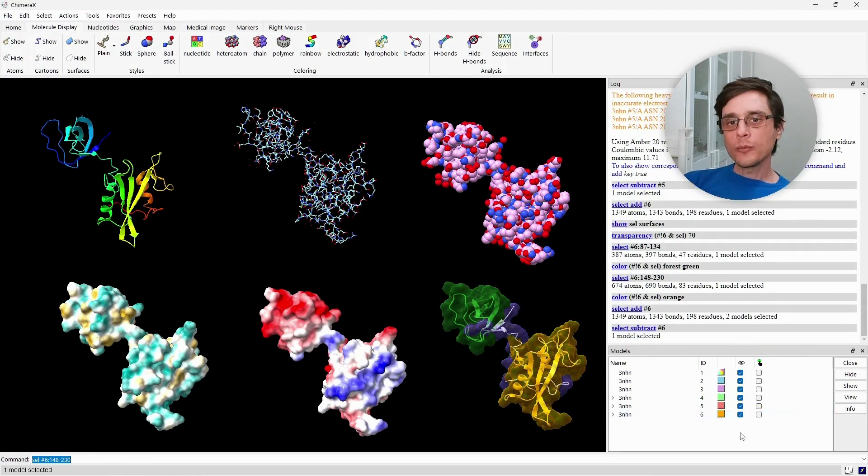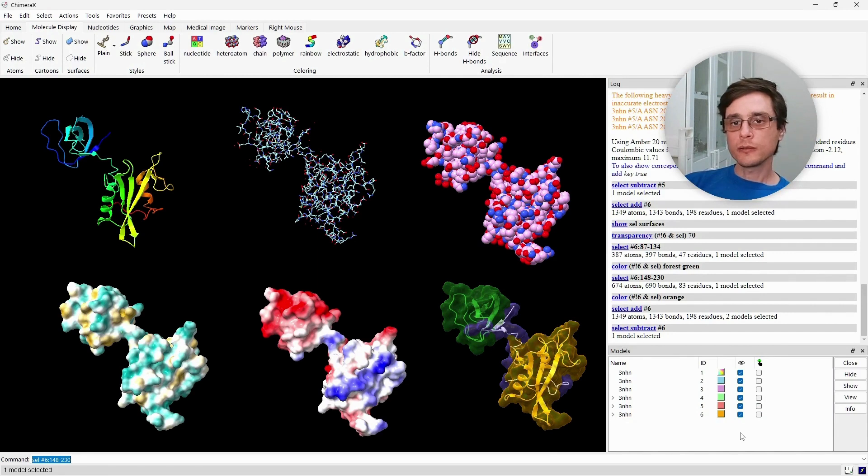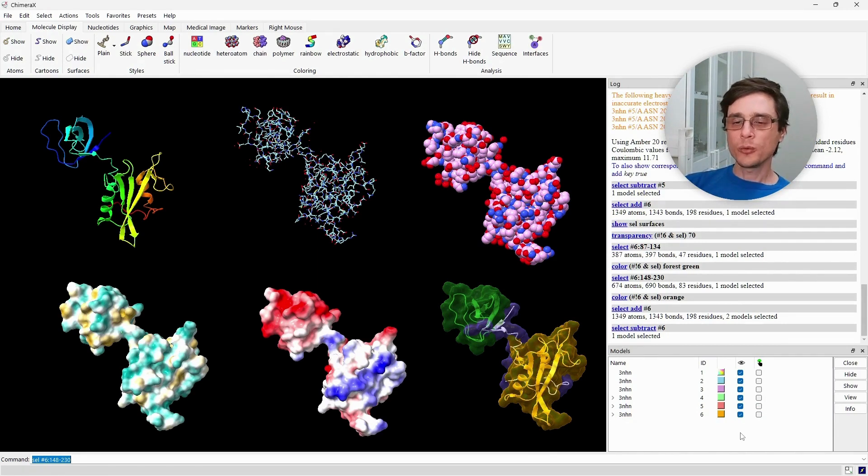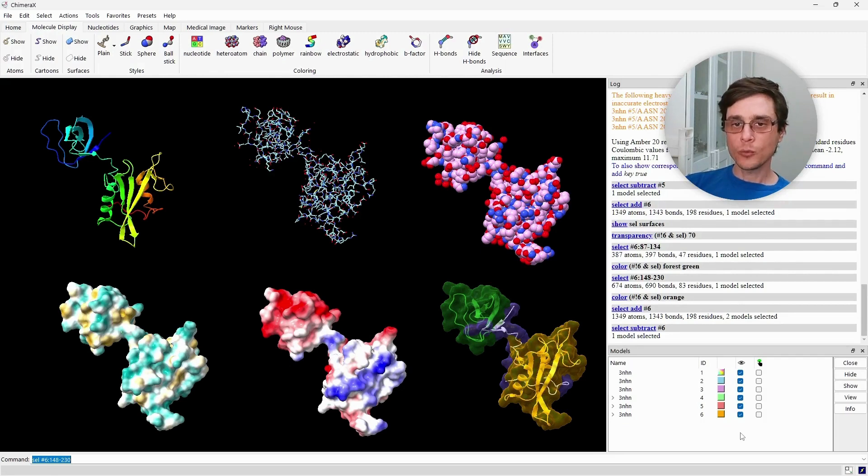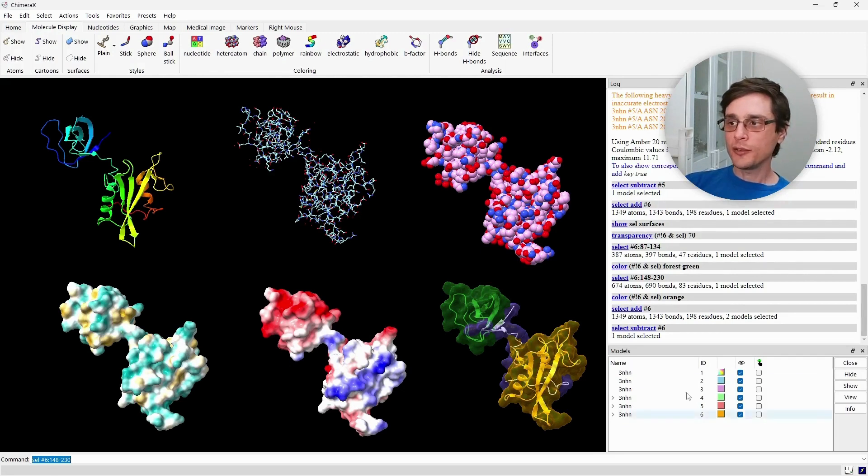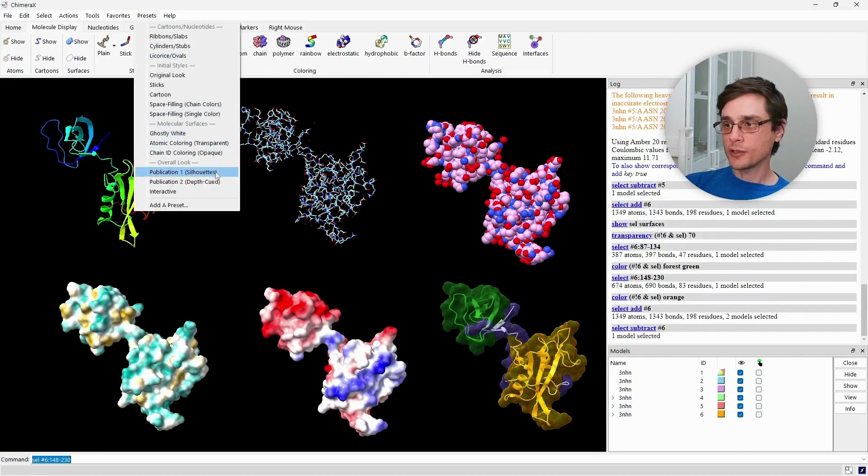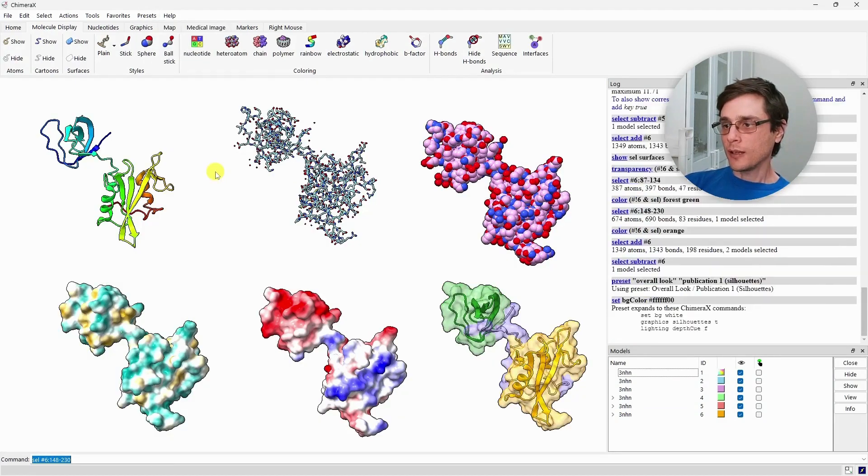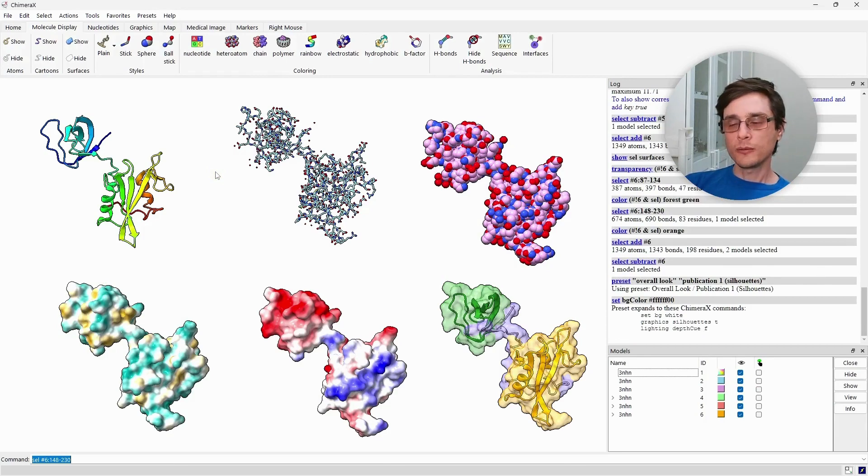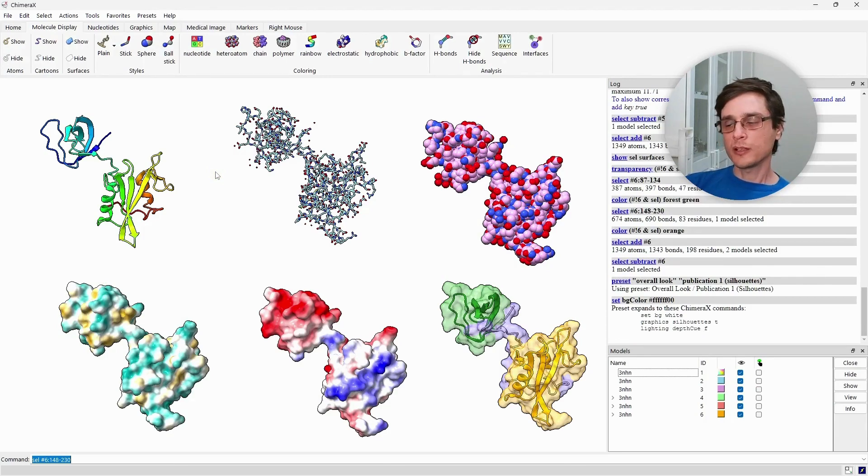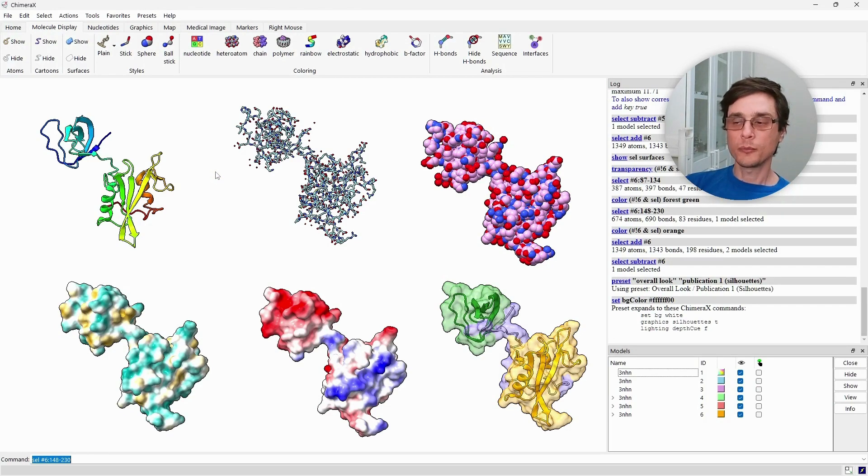Now, when you present your structures in a presentation or in a website, a black background may be suitable. But when you want to produce publication figures, you would usually use a white background. This can be done very easily using the presets. You have two presets for publications. Any of them would get you white background, and you can very easily use it to export figures that would go on your publications.